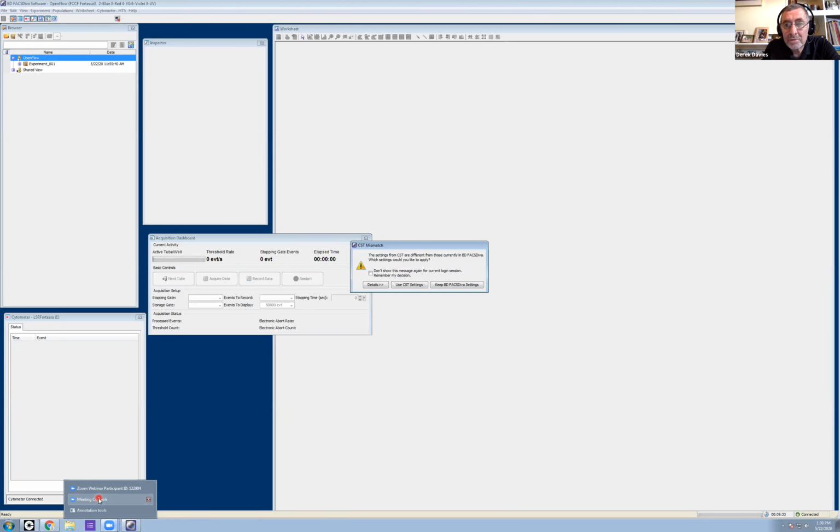So it may be different between machines, but you know what it is for your machine, and you can monitor that over time, and that's what QC is doing.